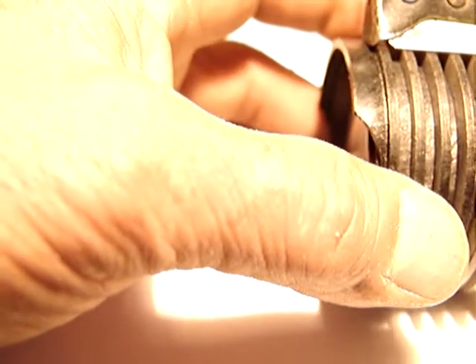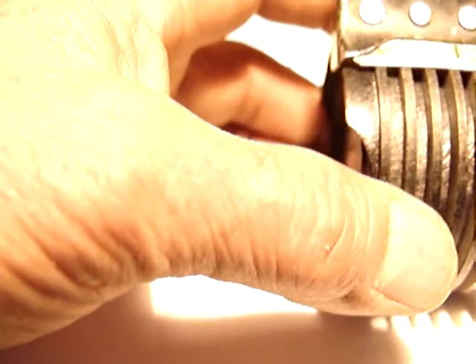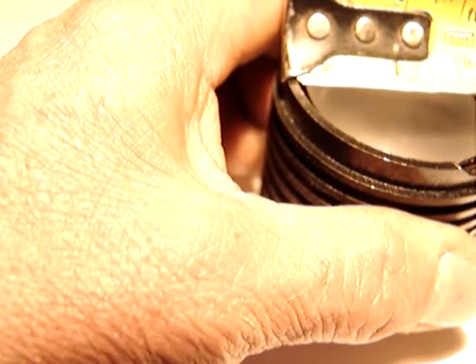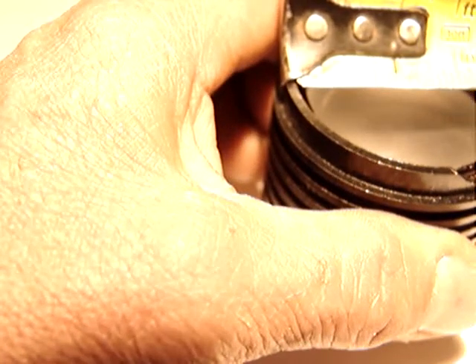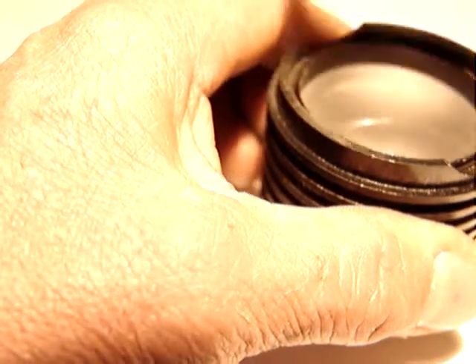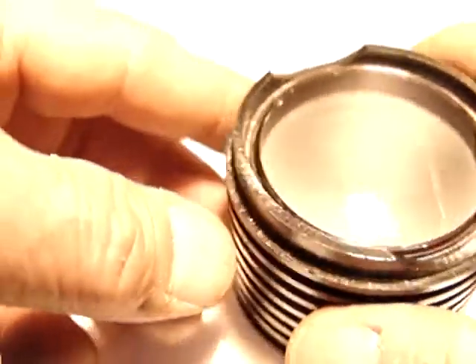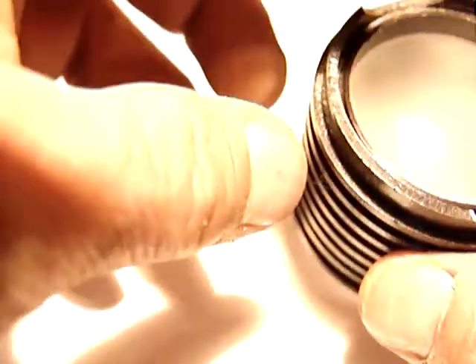It's one and three-quarter inches by two and an eighth inches side to side. So this is what you've got.